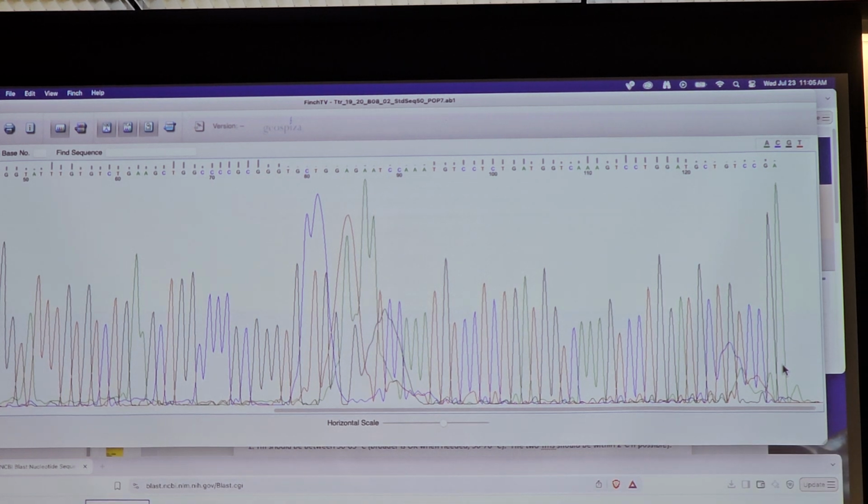Can you explain more about the dideoxynucleotide in a couple observational? Is it always usually run like a... Yes. It's always in that same region, and that's because when they're free, for whatever reason, they run bigger than when they're attached. I don't know the physical chemistry behind that.